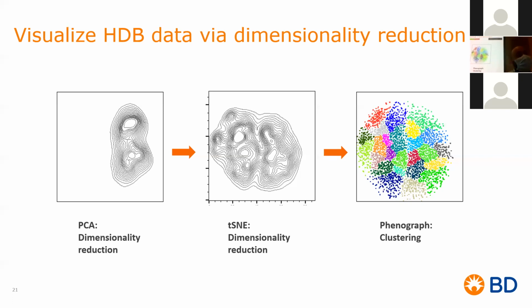But what I normally recommend is going down and utilizing the principal components up to encapsulating up to 99% of your variance. So anything that contributes less than 1% to variance, I exclude. Okay, so that gives me less than 25 components more often than not. I use those components to then generate t-SNE.